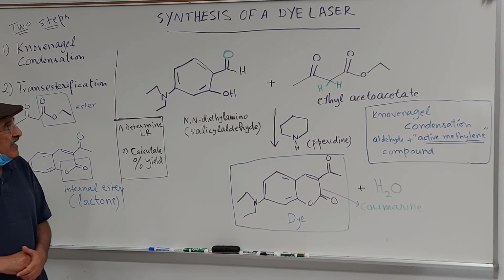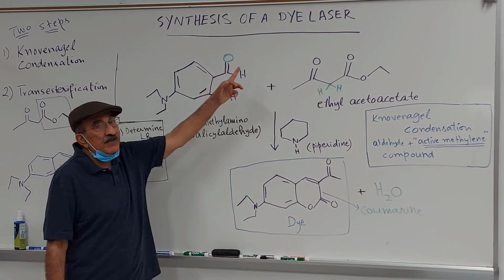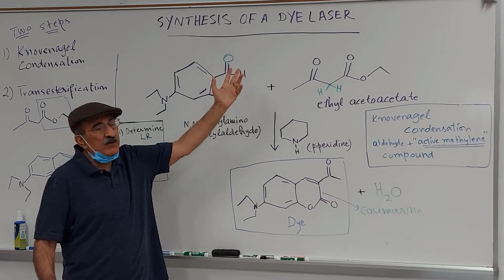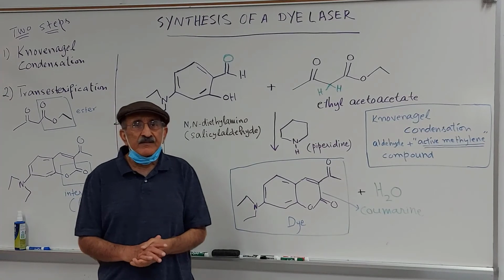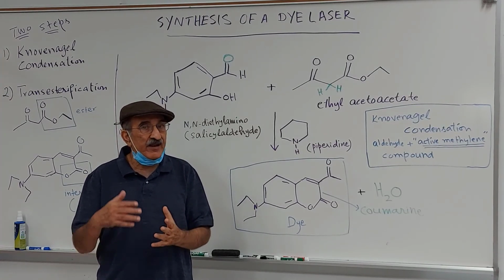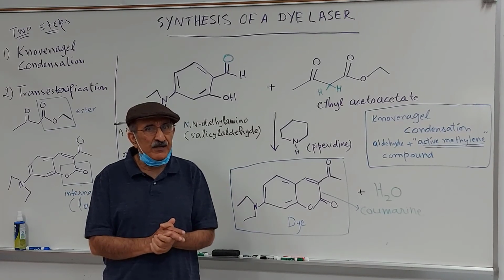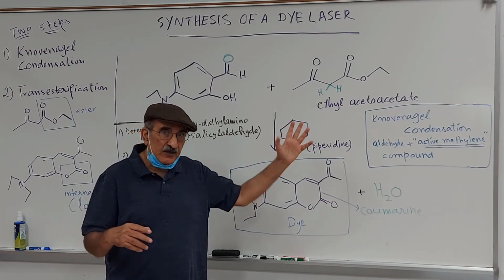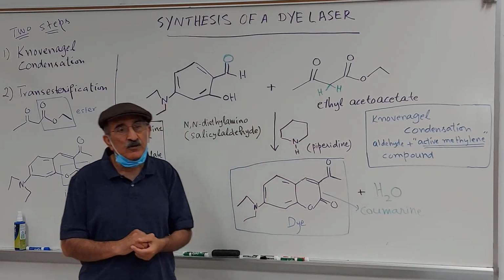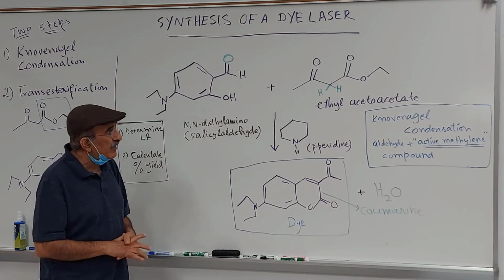Hi, in today's lab, we will be preparing a dye laser, or some people call it a laser dye. These are organic molecules that emit fluorescence when they are hit by external lasers. I have explained to you in my PowerPoint how they do that, and also the mechanism of this reaction. So you should watch that PowerPoint presentation as well.